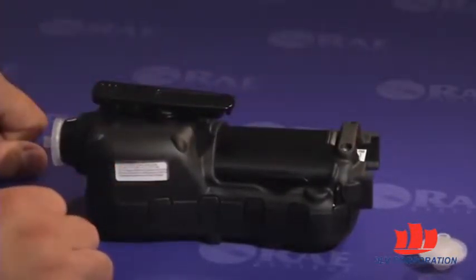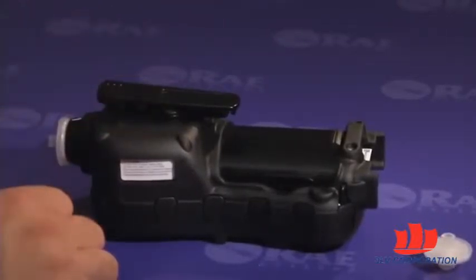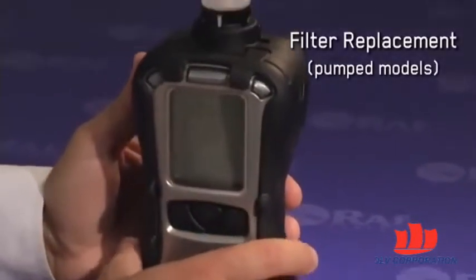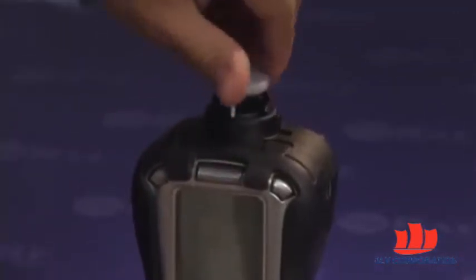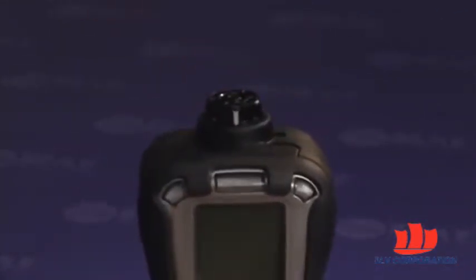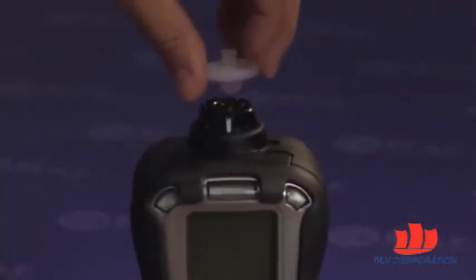Please note that to remove the battery, the belt clip or the rubber boot do not need to be removed. The filter replacement process is just as easy. If a filter gets dirty or clogged, remove it by unscrewing it from the inlet. Discard the old filter and replace it with a new one by screwing it back into place.